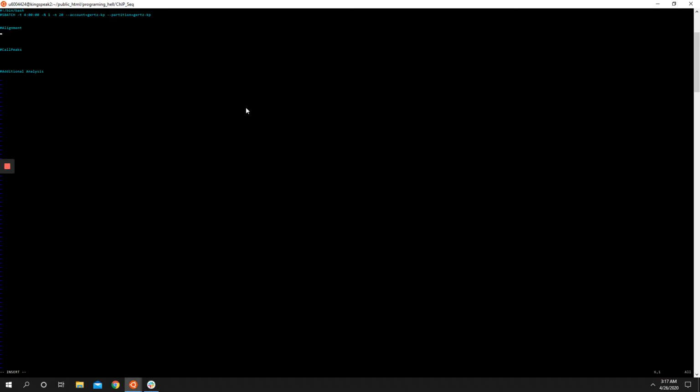So, okay, what are we going to do here? How are we going to align our files? Typically in our lab, we use Bowtie. So on the command line, we would just type out a whole Bowtie command. Bowtie is the program, and we'd give it some arguments, or what you call the additional things you add, to tell it what to do. So let's see here. I'm just going to grab this, and we're going to walk through what this is doing.